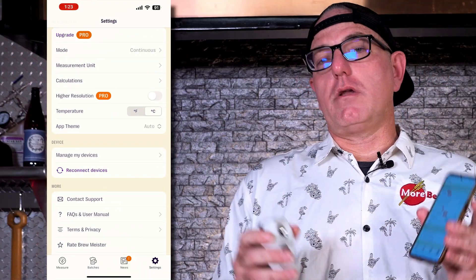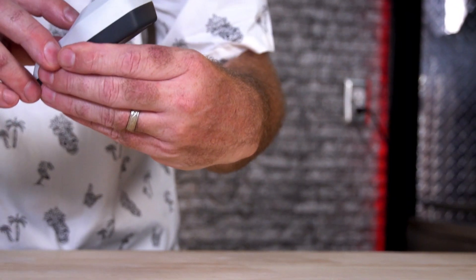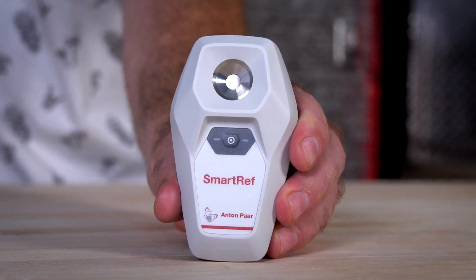Before you take your measurement, you can go ahead and alter your settings — change it from Fahrenheit to Celsius, gravity, alcohol, Brix — those kinds of measurements are all available in the settings. Once you've got the app and you're ready to connect, go ahead and hit the power button on your device, then hit connect on the application and it's going to connect and it's ready to take a measurement.